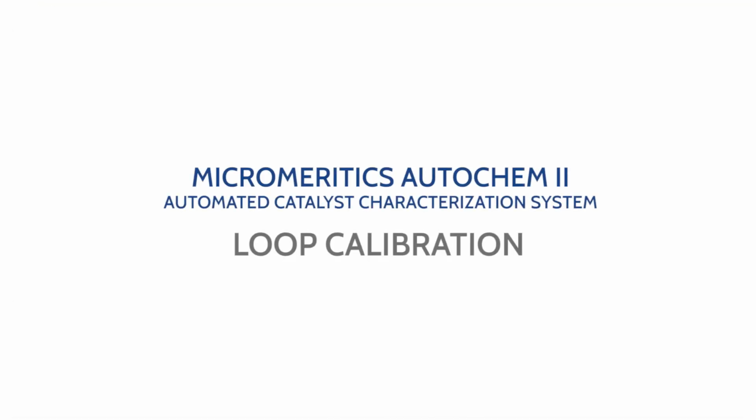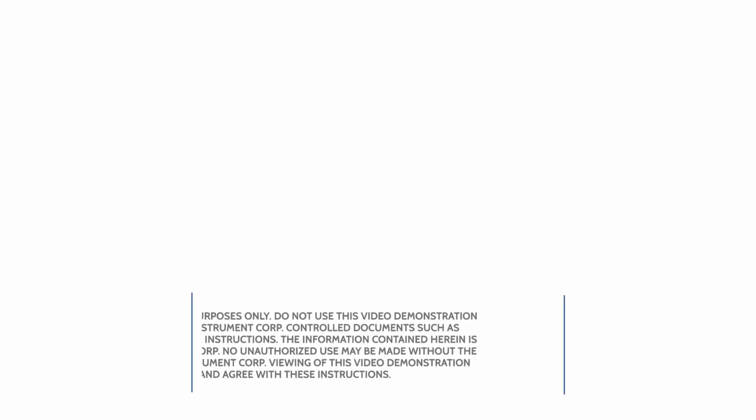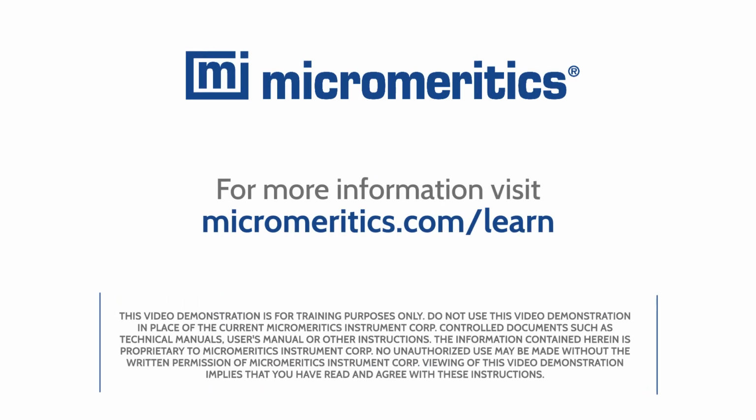You have now calibrated the loop on your Micromeritics AutoChem 2 automated catalyst characterization system. For more information, visit micromeritics.com/learn.